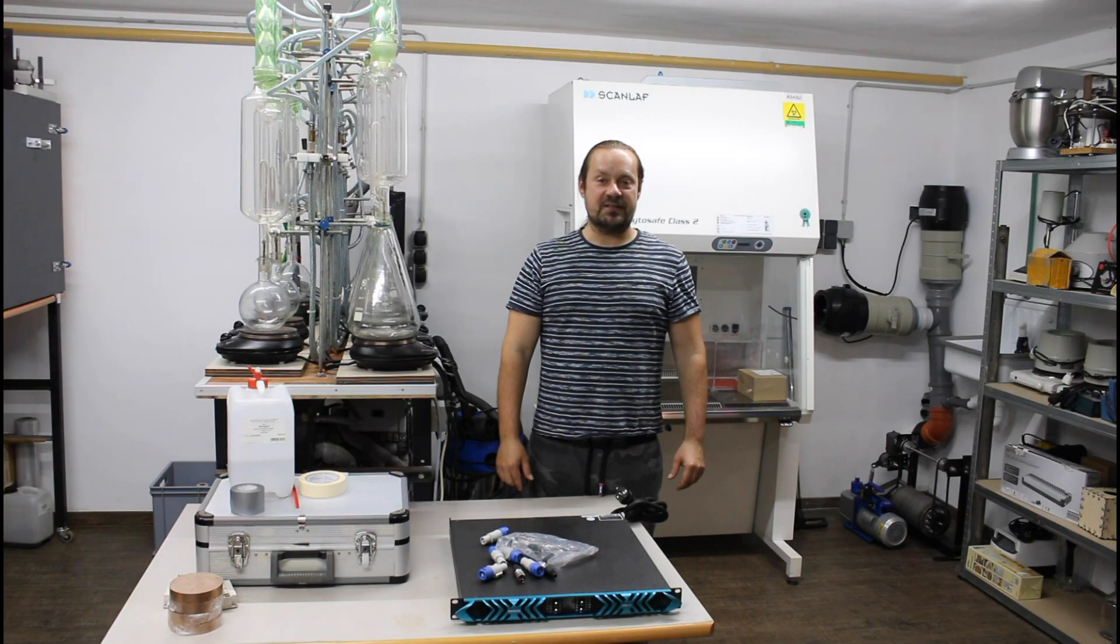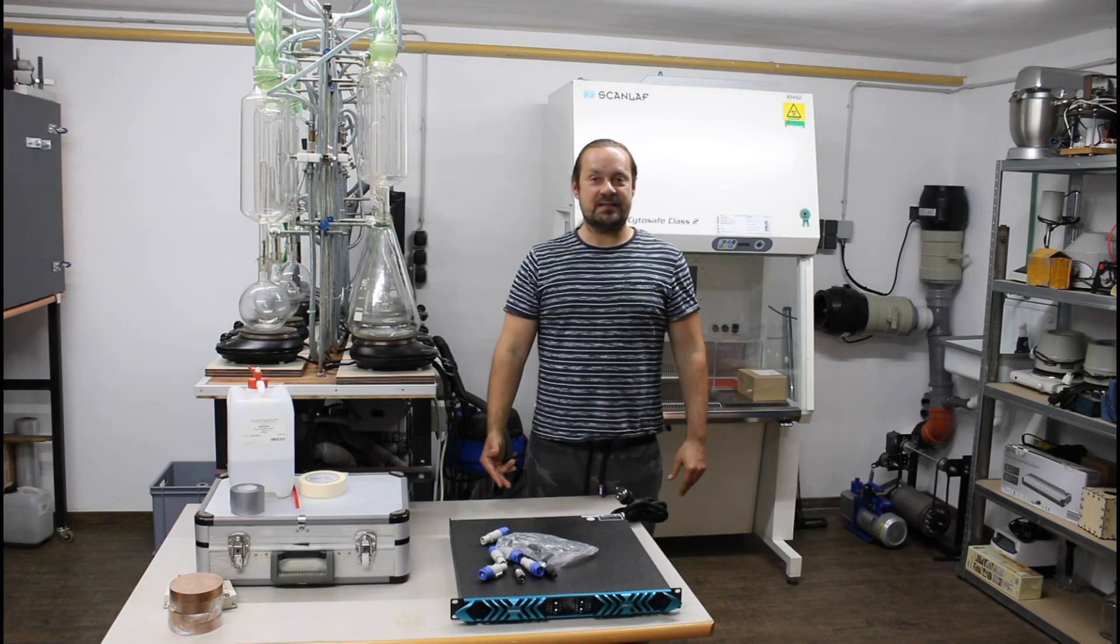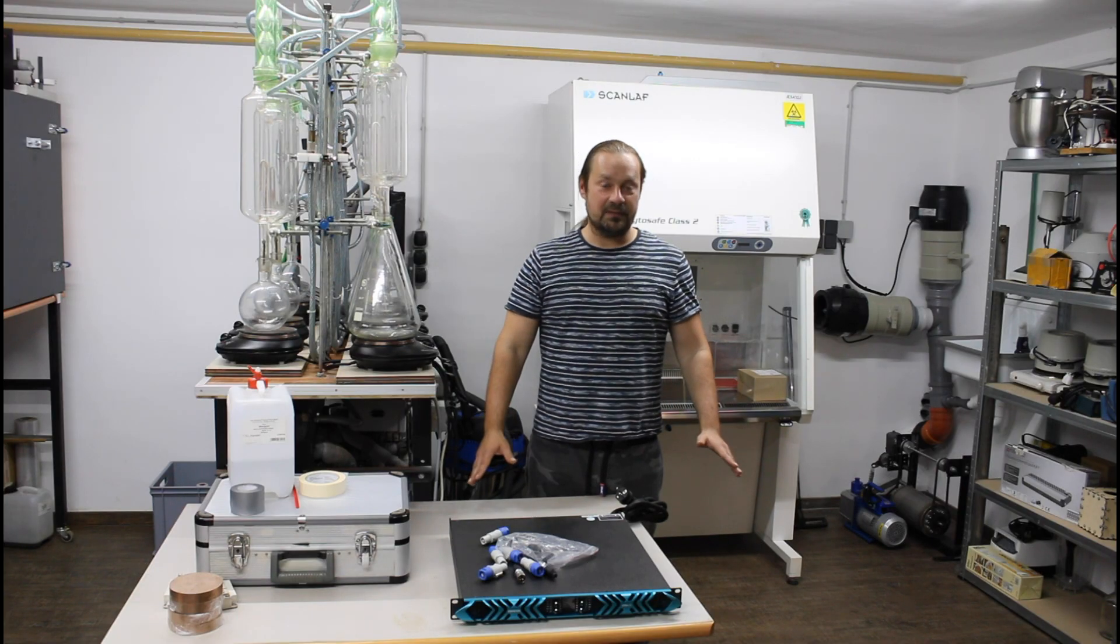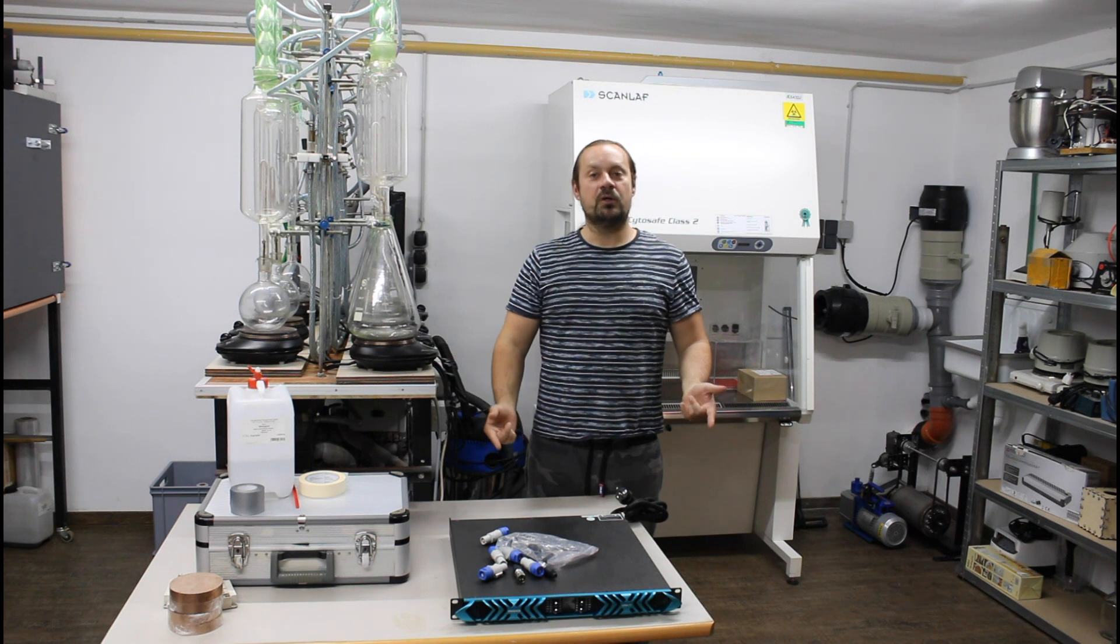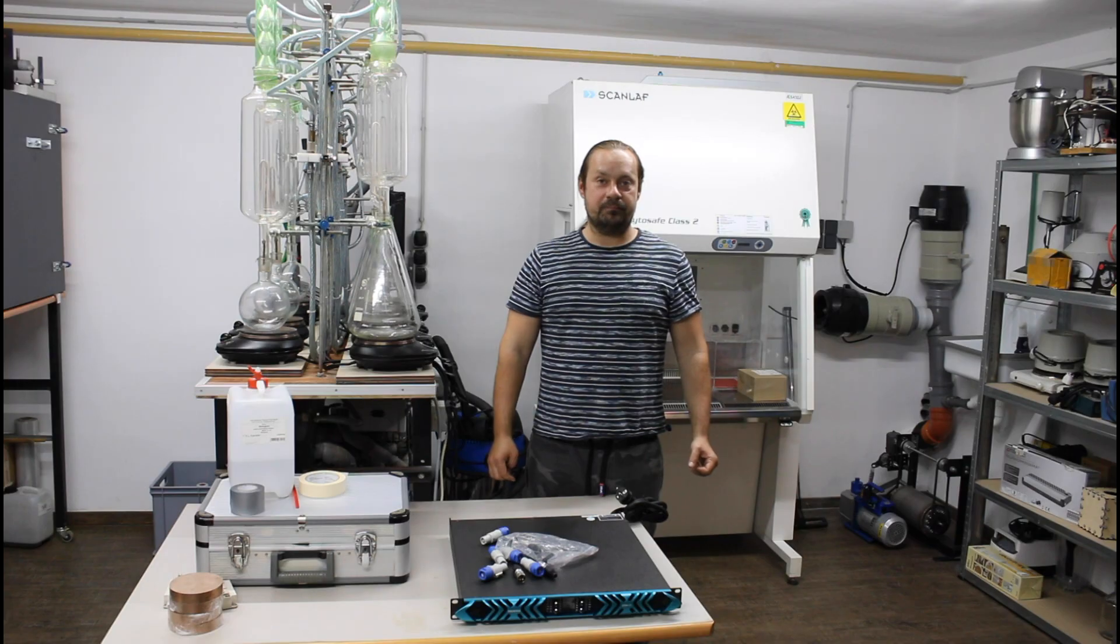Hello everyone, for those who don't know me, I am investing a lot of time and money in understanding Lyme disease and its co-infections. Recently I found out that a very useful tool for diagnosing Lyme disease and some of the co-infections is a dark field microscope. Dark field microscopy, even though university-taught medicine thinks it's BS, turned out to be really useful for diagnosing those diseases.